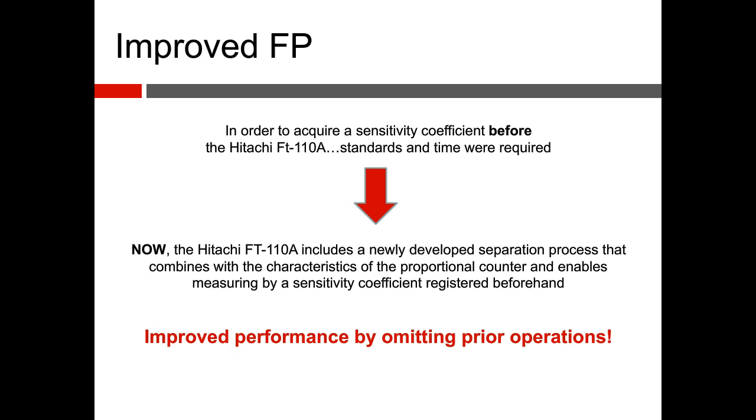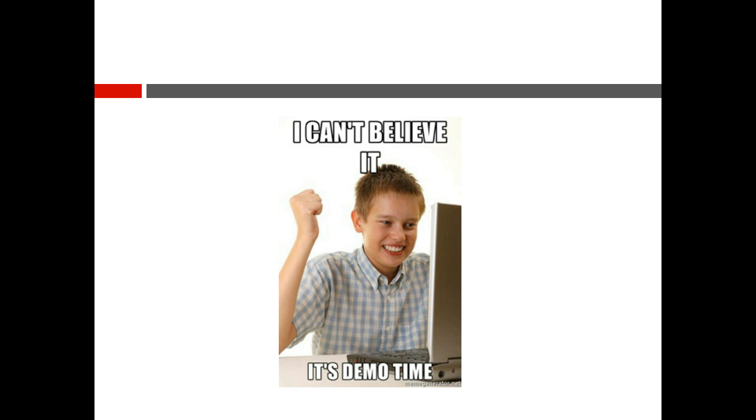Right now we're going to look at a quick video that Bob Mull put together on adding calibrations. So you can believe it, it's demo time.